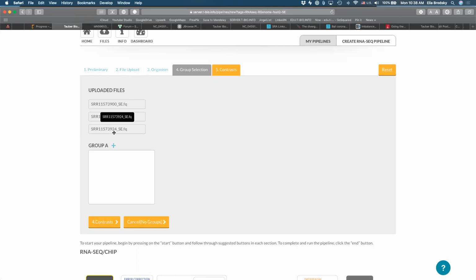When you have multiple, you use the URL bulk upload. So if we download the links, we use the first option of upload files. Yes, and I will show you here in a second, in a different example, how to do it directly from NCBI. Okay, so this was to get you started, and we'll add more complexity as we go through the program.